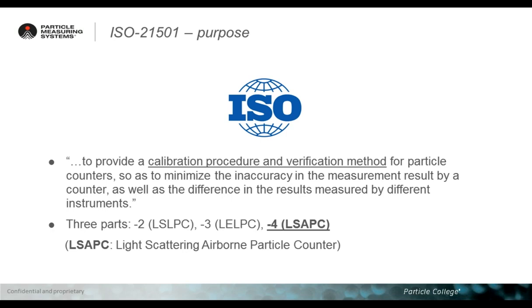In this way, any particle counter you get, no matter the manufacturer, should perform exactly the same way as the others, because now all of us follow a common standard to calibrate the particle counter, whereas in the past any manufacturer was allowed to use any kind of different methodology for the calibration.